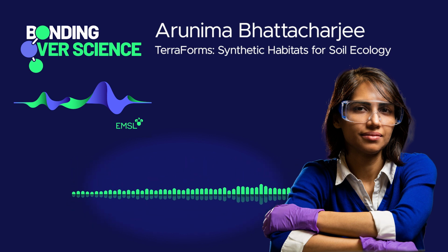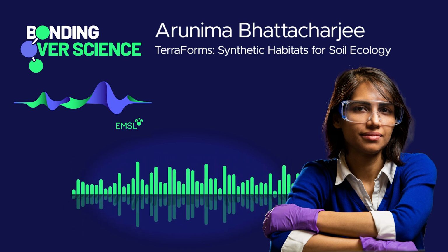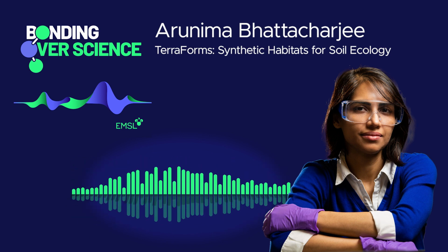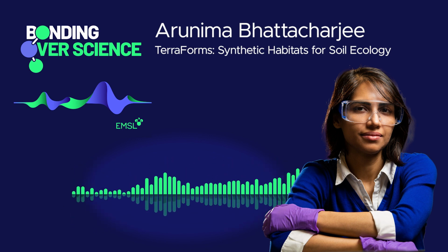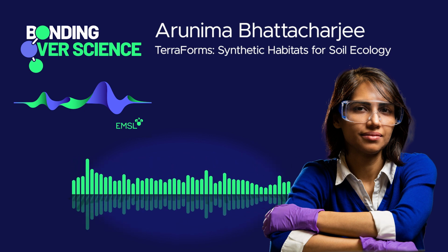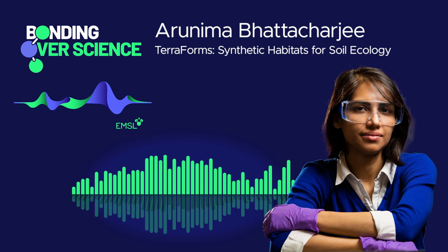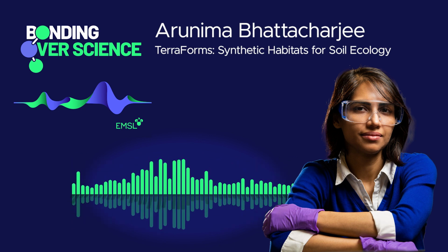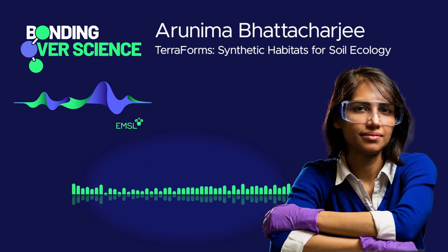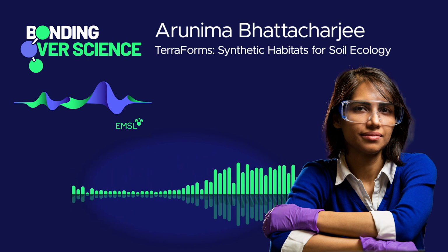You mentioned mass spectrometry. What are some other ways that you take a look at these metabolites? So definitely mass spectrometry based techniques are primarily used. And within that, we use MALDI, we use nanoDESI, we use SIMS, NanoSIMS, and all of these. So what I have realized is not one technique can be used to decipher the whole process of nutrient cycling, for example, what kind of metabolites they're making, what metabolites chelate certain inorganic nutrients, and uptake them inside of the hyphae in case of fungus, or inside of the bacteria cell. So we need a combination of several different techniques, which led us to make these TerraForm platforms compatible for a wide range of analysis techniques.